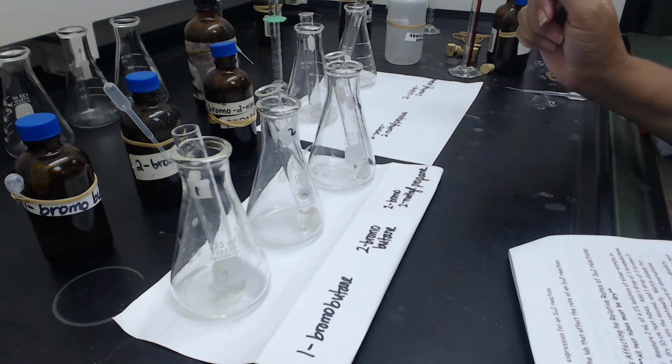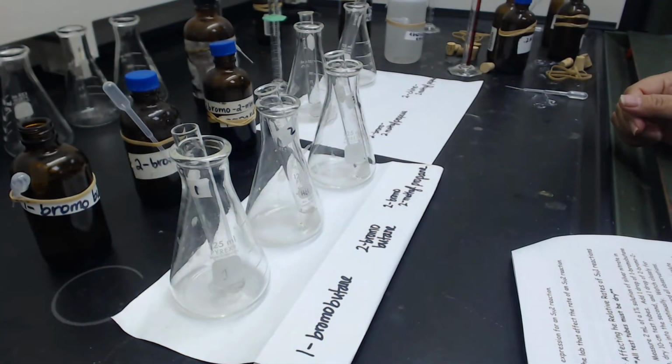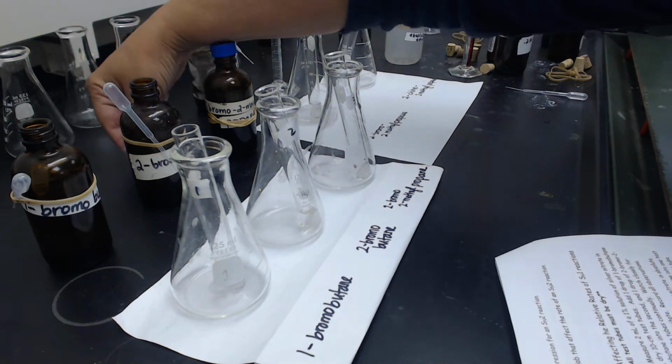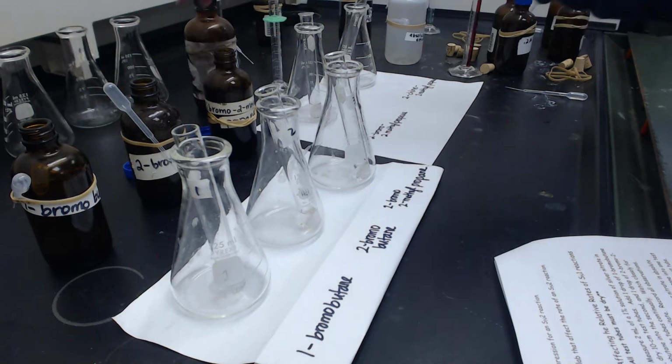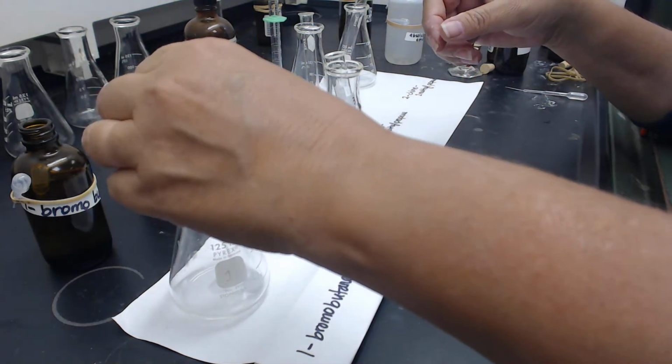So I'm just going to add 1 drop at a time. It might be a little bit hard to do because you kind of gotta watch closely. I'm going to try to do it as fast as possible. And I've also numbered the test tubes 1, 2, 3, so I can stir them all at the same time.